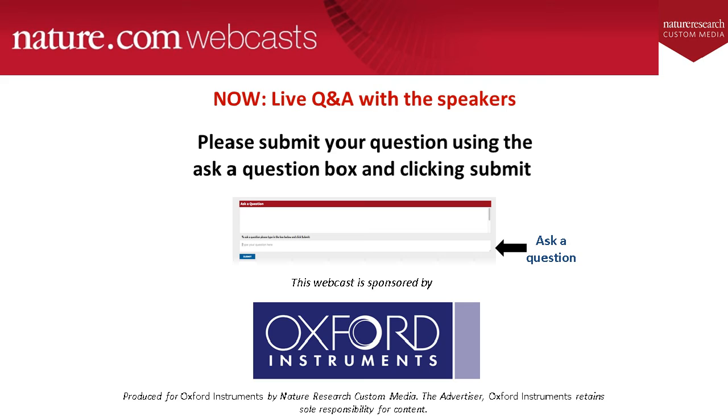And there are things you can do to mitigate that, like perform the dehydration and the resin infiltration at lower temperatures, for instance. But I think there's lots of good reasons why you would do EDS on stained and embedded samples. We've seen several examples in this presentation where you can get very nice elemental maps from samples that have been prepared for standard TEM.